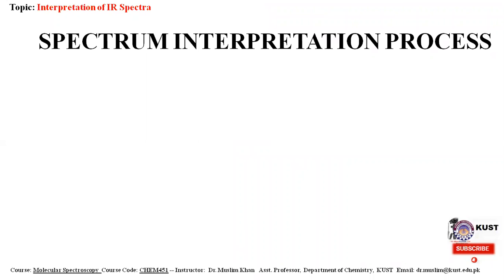First of all, to discuss the spectrum interpretation process, suppose that we have done an experiment. We have subjected our sample to the IR spectrophotometer.